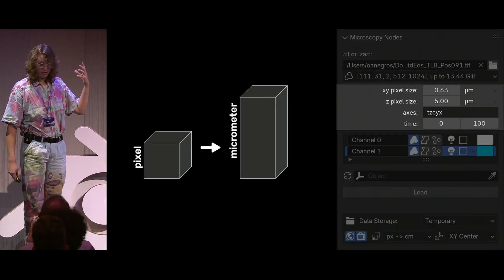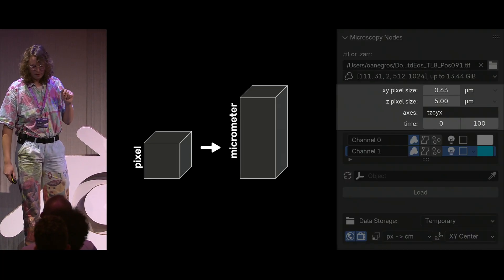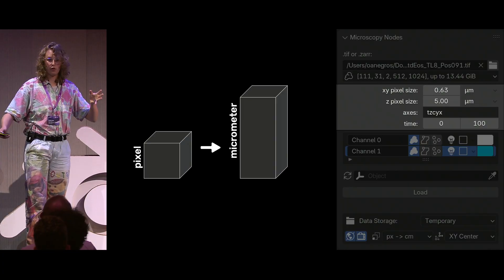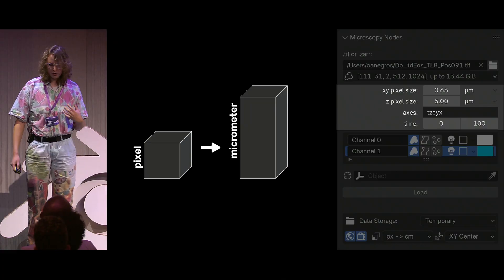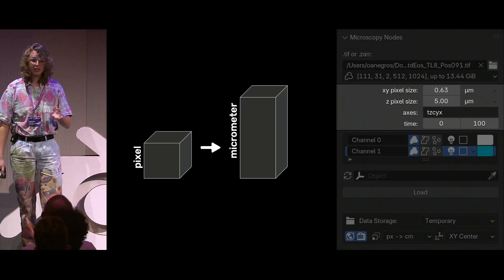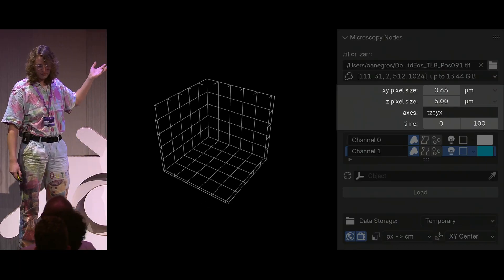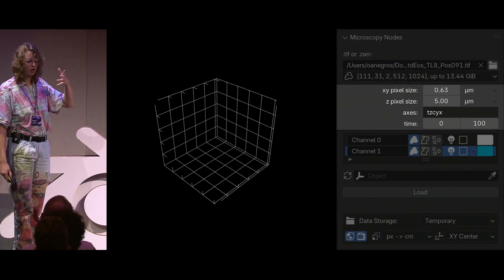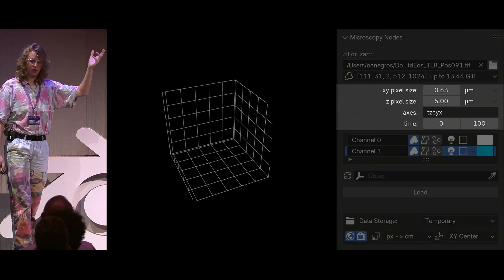Then there is a whole part on metadata, mapping pixels to micrometers, and or nanometers, or Angstrom, or whatever your unit is. This is really relevant, because people care about how large their stuff is, but this also gets read out automatically. This then generates this scale grid in your scene, that's a geometry nodes object, that when you rescale it, it remains accurate physical sizes.